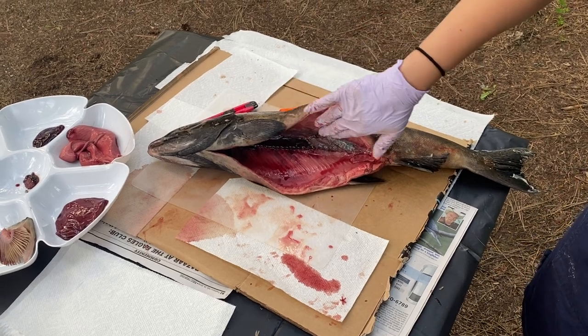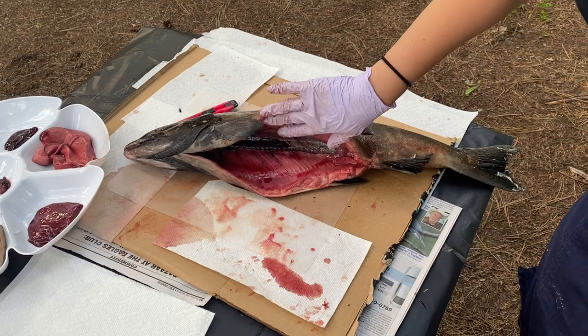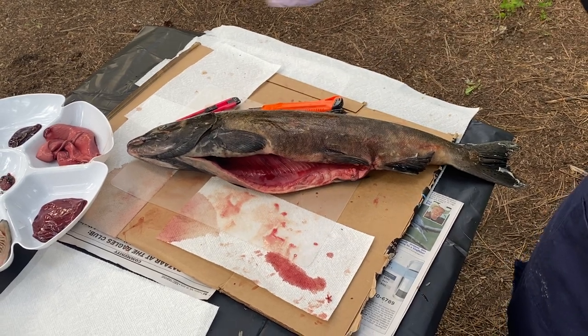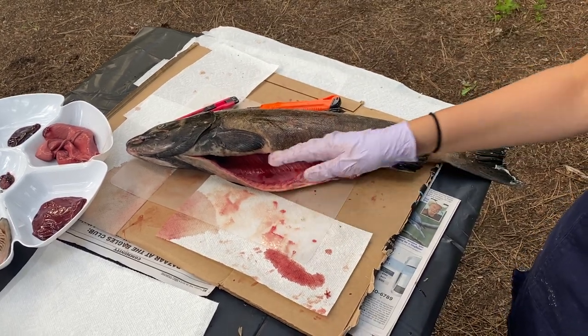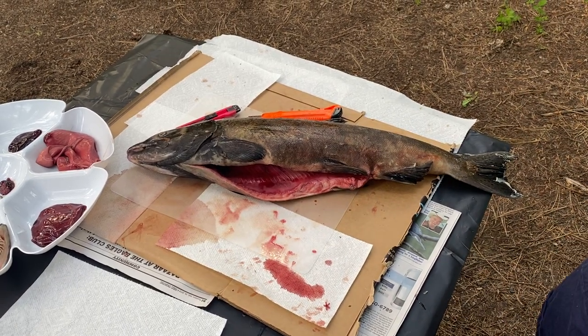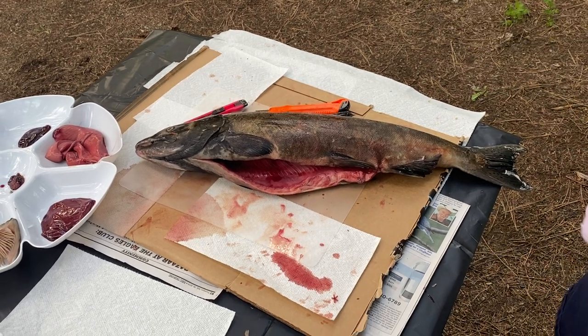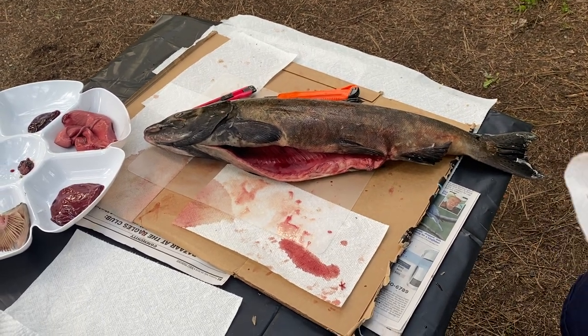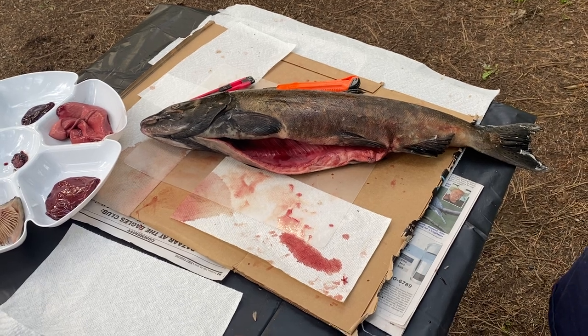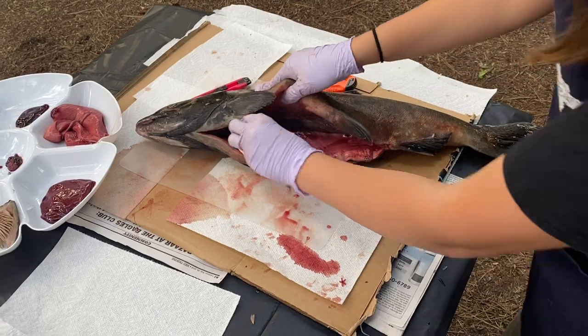But for salmon, it also helps with osmoregulation, which I don't think you guys have heard me say before, but that just means what's happening on the outside of the salmon is going to be even with the inside of the salmon. So we have to think about when these fish are in salt water, their bodies need to stay fresh and not too salty. So they have to balance that salt content out in order for their bodies to be happy, or also the opposite. If they're in fresh water, they still need a little bit of salt in their body. So they've got to make sure that they have a good balance from each side.